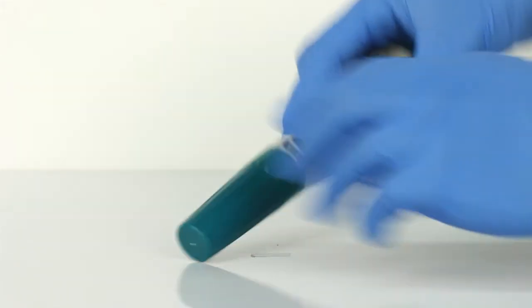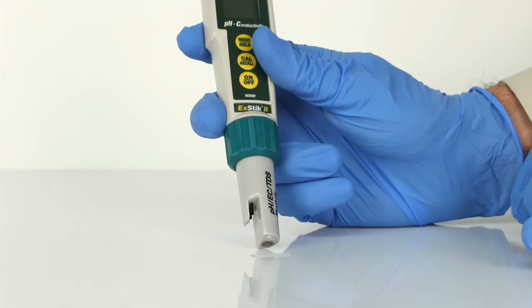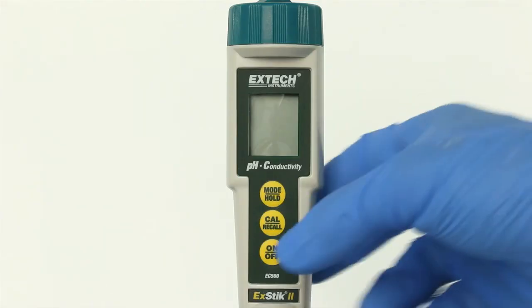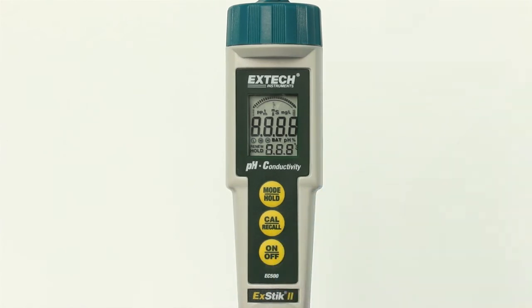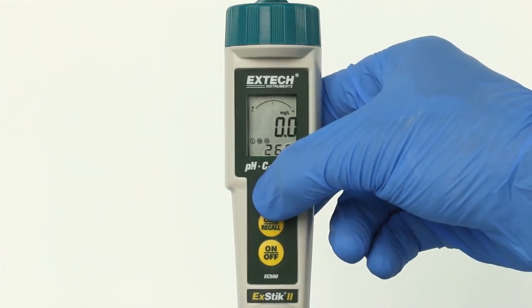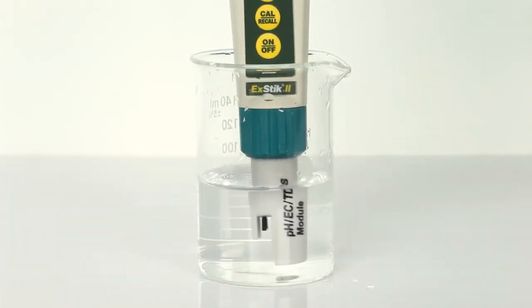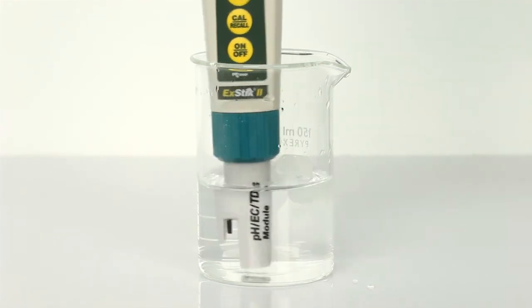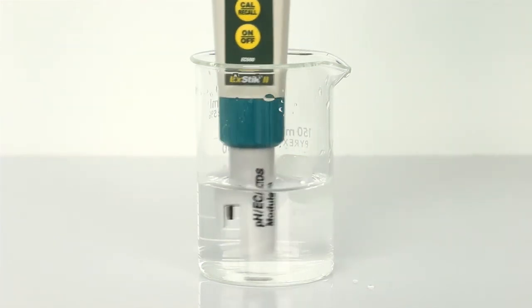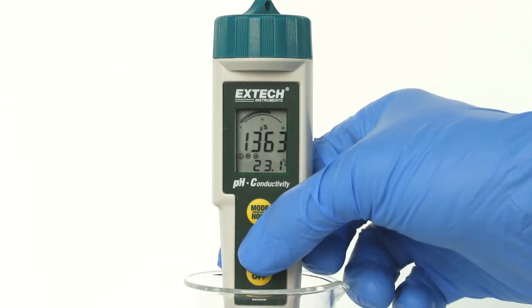Remove the cap from the bottom of the X-TIC to expose the pH electrode, reference junction, and conductivity electrodes. Press the ON button. Self-Cal will appear in the display during the turn-on diagnostics. Press and hold the MODE button to scroll to the desired measurement mode. Insert the electrode into the solution. Move the electrode gently in the sample to dislodge any air bubbles.